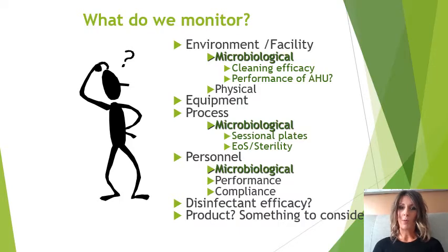Okay, so what do we monitor? We have many things in the clean room that we have to monitor, and it's not just all about microbiology. We monitor the environment, so the clean room itself, the facility. We do microbiological monitoring, and this is by a number of means that I'm going to discuss in a bit.